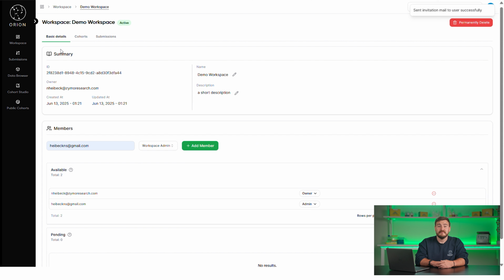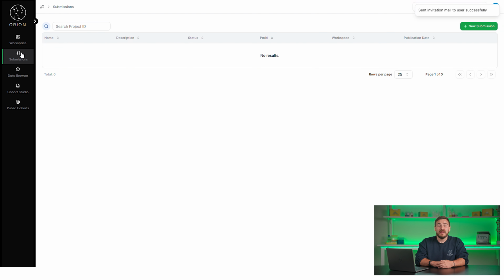data into it. To populate a workspace with data, we will come here to the Submissions tab. Let's make sure that we have the workspace we'd like to bring our data into and is selected here in our top right dropdown. On our submission page, we will be able to see all of our historical submissions for this workspace with a brief summary of each. Right now, we have not submitted anything to this workspace, so it's blank. So let's fix that with a new submission.